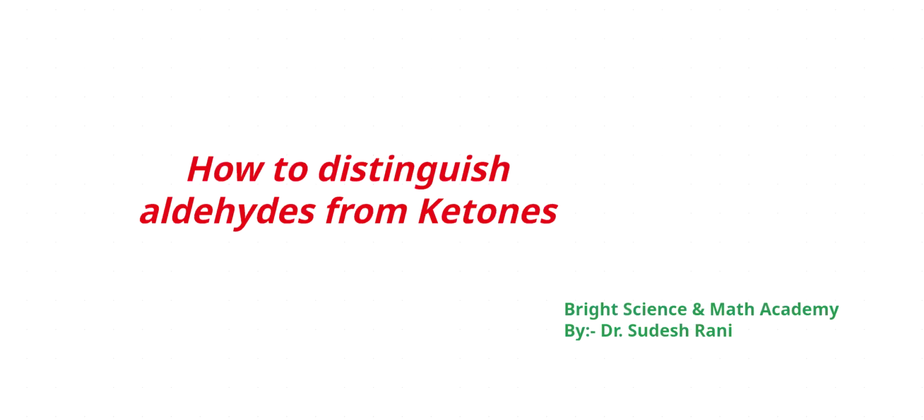Good afternoon, everyone. Today we will discuss how to distinguish aldehydes from ketones. There are particular tests which are performed to distinguish aldehydes and ketones, and one of them is oxidation reactions. How will oxidation reactions help to distinguish these? Moving ahead to discuss it in detail.